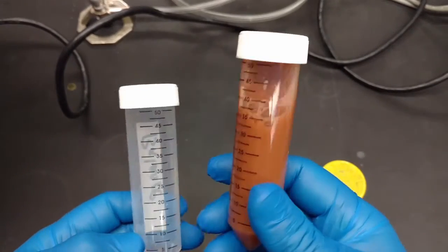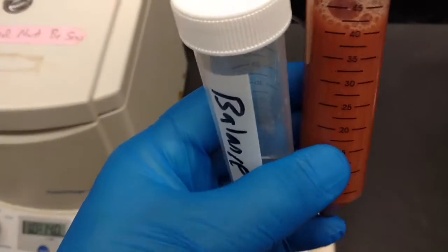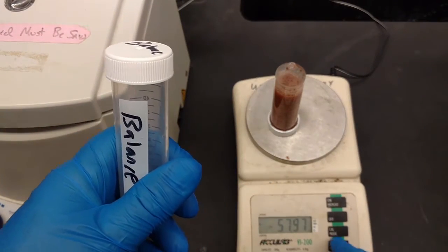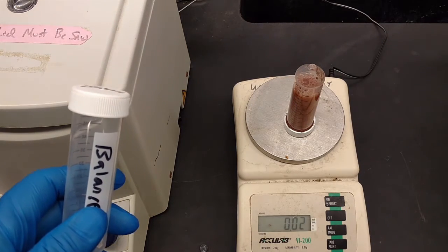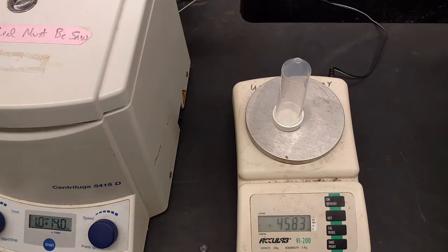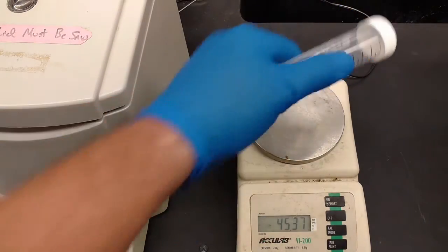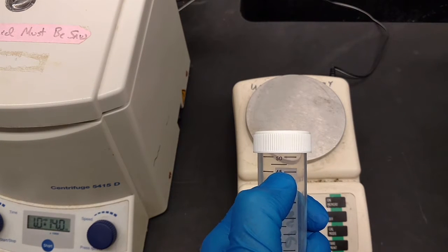Next step is to put this in a centrifuge. To do that we have to balance it, so we need to weigh this. Put it on a scale, zero out or tare the one that's filled so it reads zero, then put the empty balance tube on and it'll tell you how far off it is. Right now it's at minus 45.82 grams, so you need to add 45.82 mils of water — about 46 mils — fill it up to right about there.